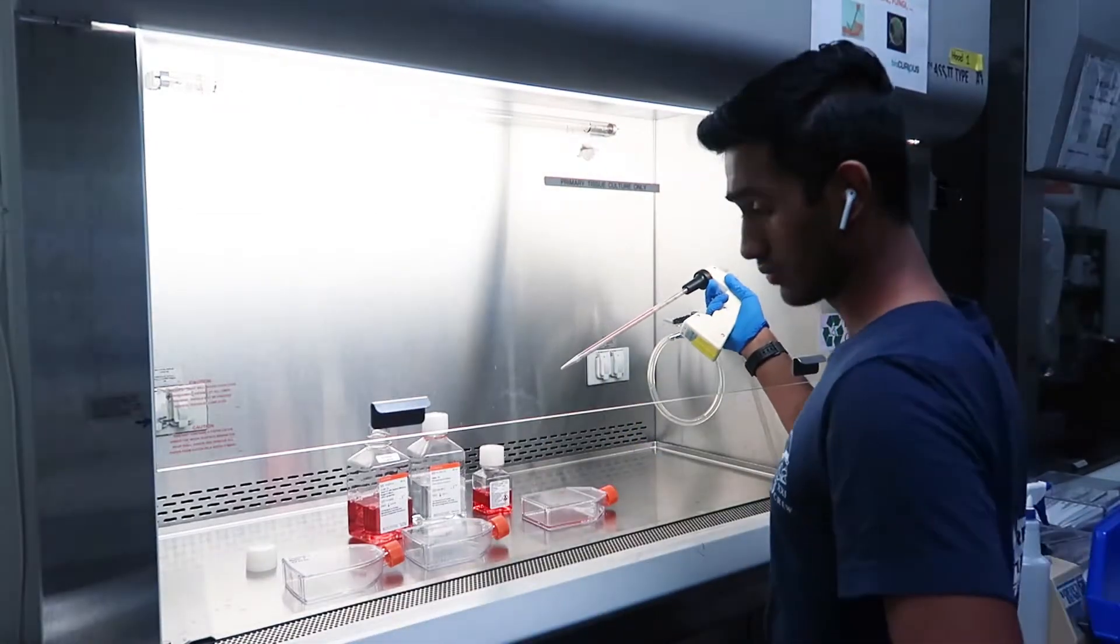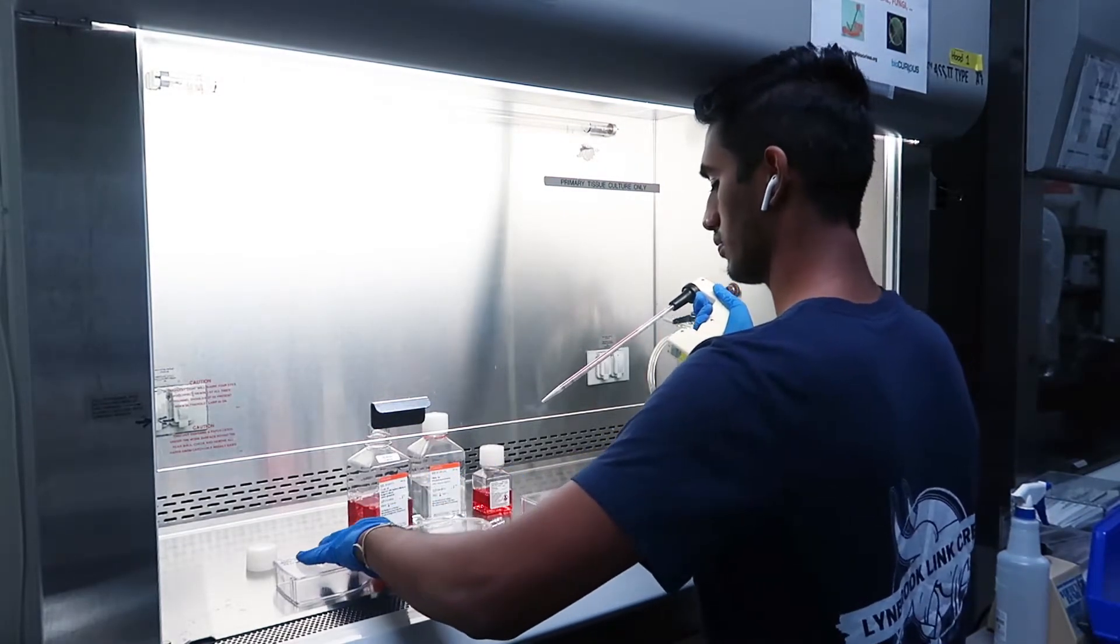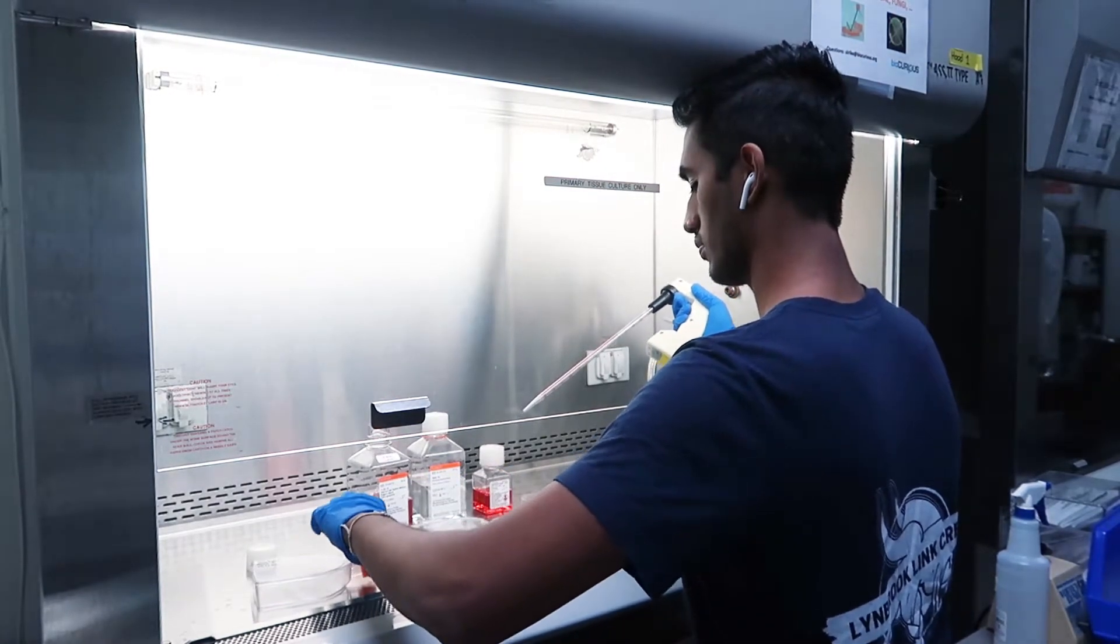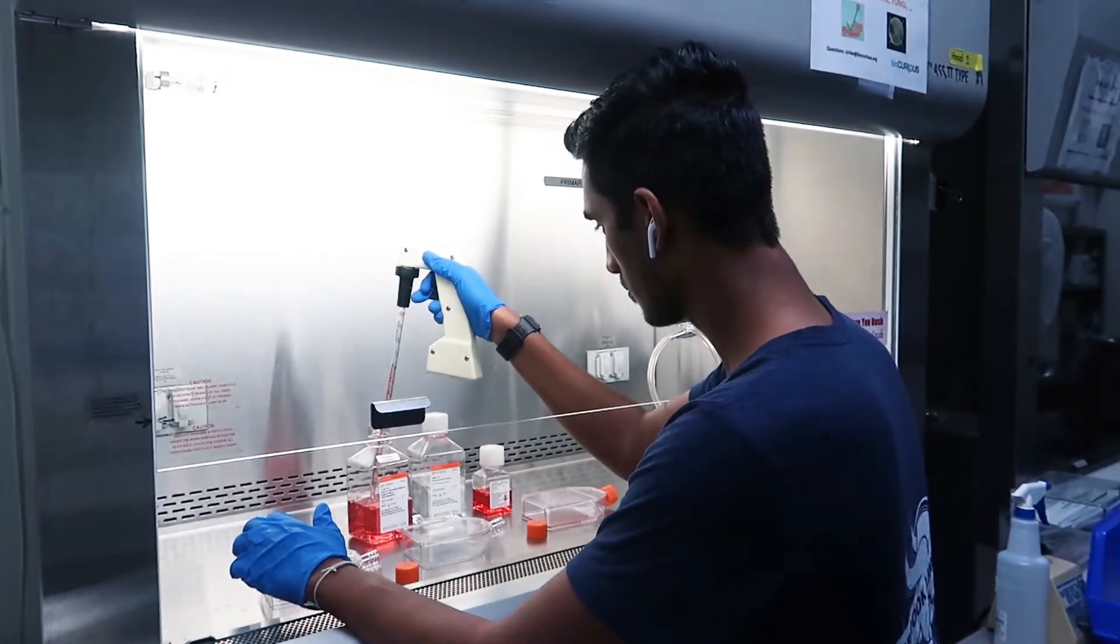Now that you have a single suspension, you want to prepare two new culture flasks. What we're going to do here is add 15 milliliters of your medium to the two new TC75 flasks.